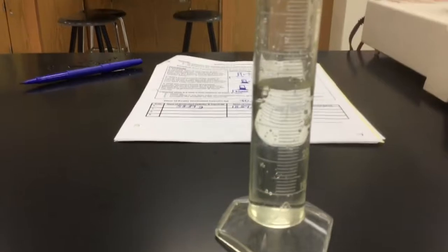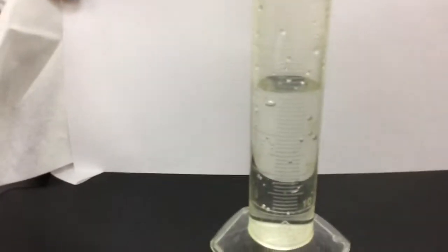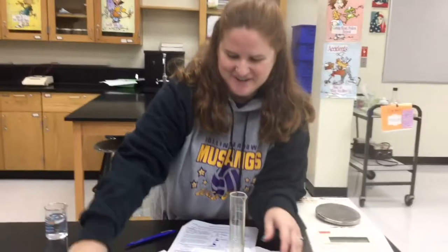So I'm going to dry off my cylinder. I think I need lines behind it. Let's put some paper. Can you see? It looked to me like it was 40.0. I think so. Okay. Maybe double check because it's kind of hard to see through the camera. It is a little. All right, so you're gonna use the paper here to check out the meniscus.